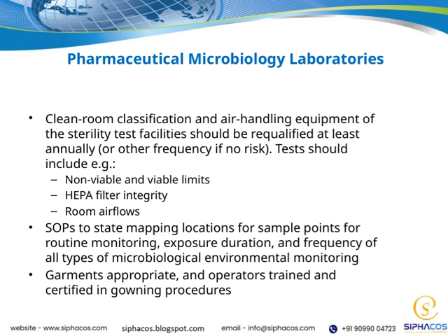During these requalification tests, we typically check non-viable and viable limits to ensure the environment remains within acceptable microbial limits. We also verify the integrity of HEPA filters, which are critical for maintaining air purity. Additionally, room airflows need to be assessed to confirm that air is moving correctly and preventing contamination.